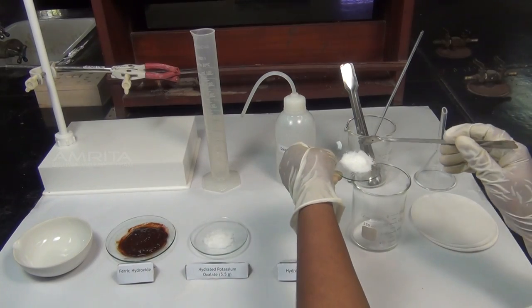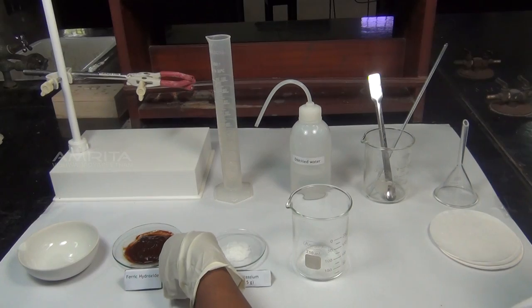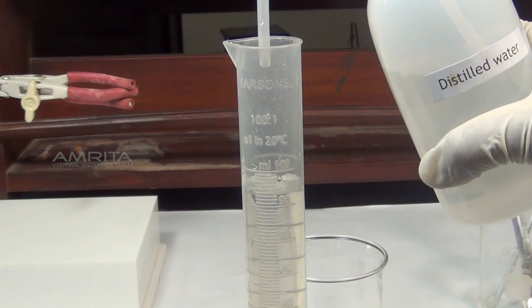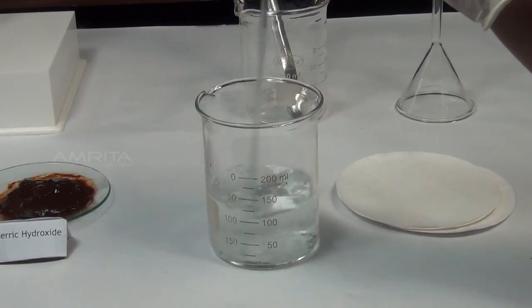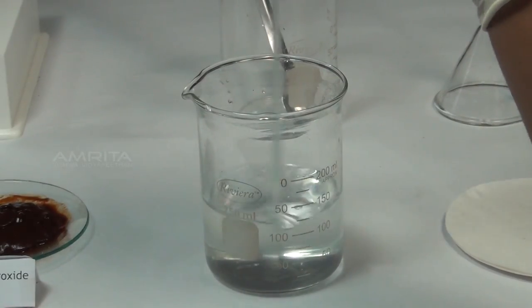In another beaker, take 4 g of hydrated oxalic acid and 5.5 g of hydrated potassium oxalate. To this add about 100 ml distilled water. Stir the solution thoroughly using a glass rod to get a clear solution.